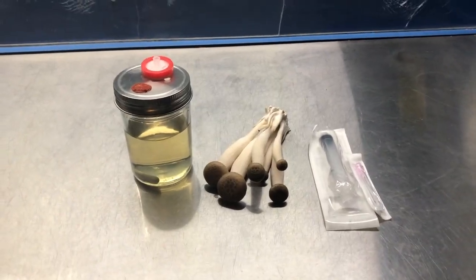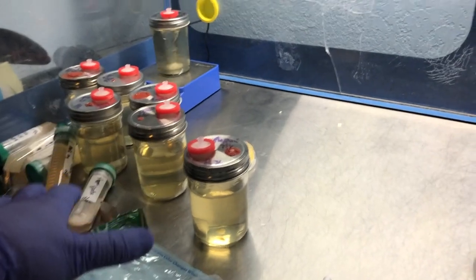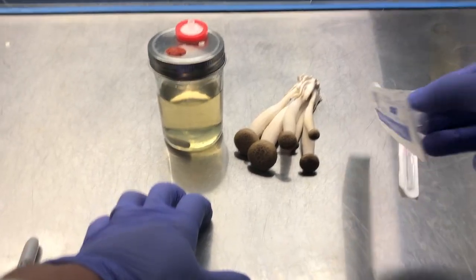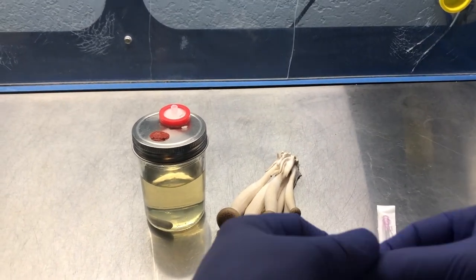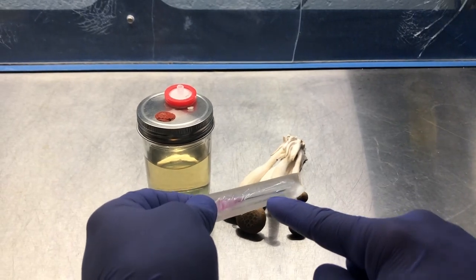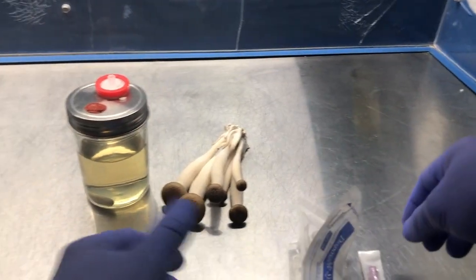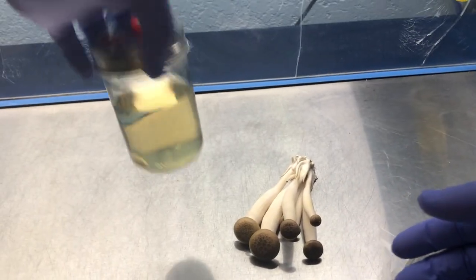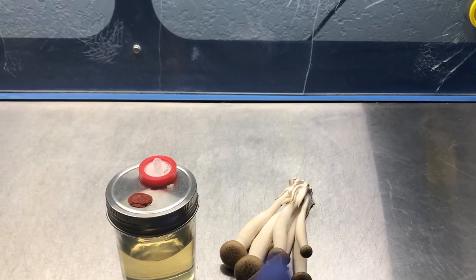Okay, guys, so I've got my liquid cultures from my slants over here, and now I'm going to move on to my needle tissue biopsy. So the idea behind this is that you can just take a piece of tissue using a sterile needle and then shoot it into the injection port, and it will go into your liquid culture without ever having to use a blade.